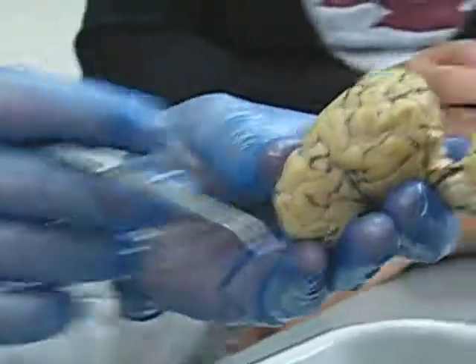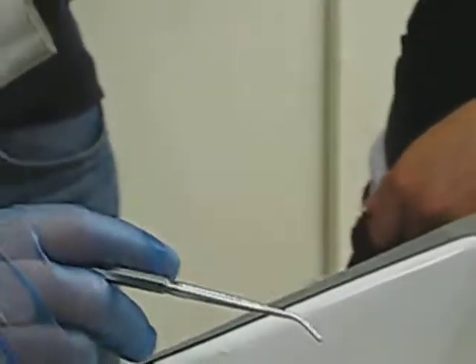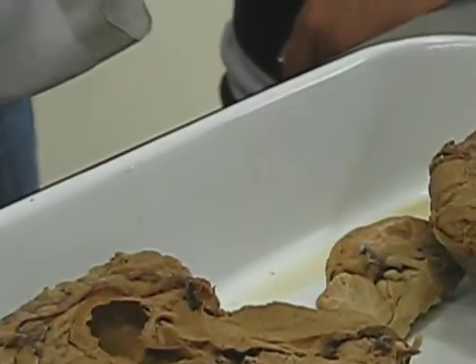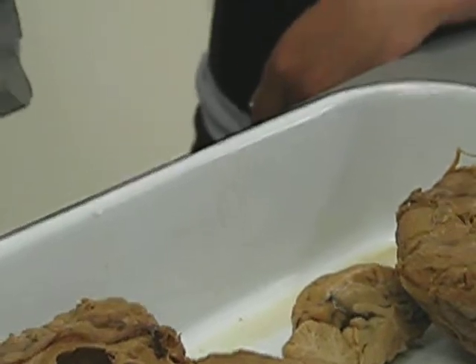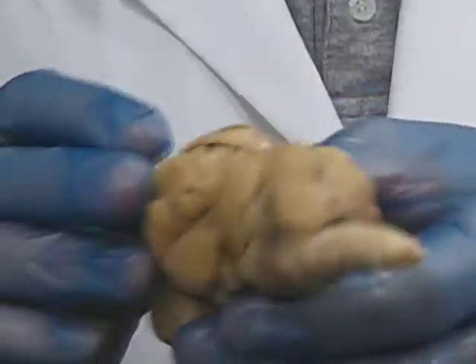The superior and the inferior colliculi. You've probably seen these on a sheep already. This is probably a review, right? You've seen this stuff? Those are the superior colliculi and the inferior colliculi. They make up the corpora quadrigemina, or the tectum, as it's also known.